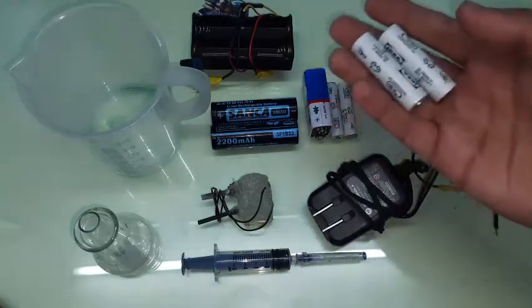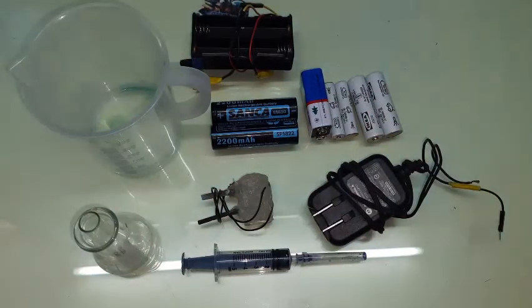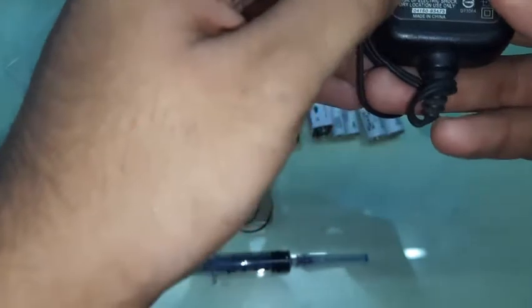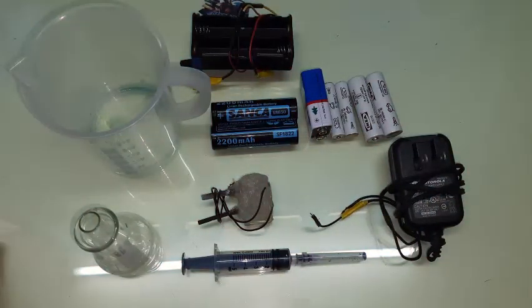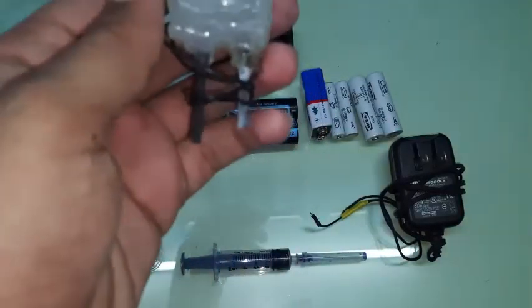You can also use a 9 volt battery, or double-A or triple-A. Make sure you use rechargeable batteries, not alkaline ones — they drain up so quickly. Anything that gives about 1.2 to 1.4 amps of current should be fine. You can also use an old phone charger if you don't have batteries; this one is 6 volts at 1.2 amps and it should work.